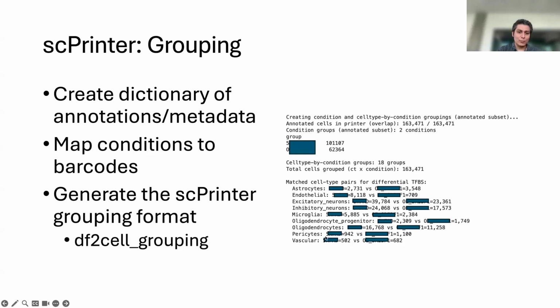I would highly recommend when you go through the tutorial on these, inspect the data structures of their toy datasets, and that gives you a really good idea of what these functions are expecting. The source code is also available on GitHub, so you can definitely look through those. And that'll also give you clues as to what this is expecting a little bit more explicitly.